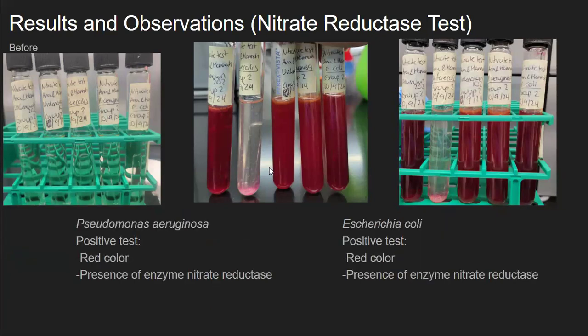Pseudomonas aeruginosa was also a positive test with red color and presence of enzyme nitrate reductase. Escherichia coli once again was a positive test. Red color, presence of enzyme nitrate reductase.